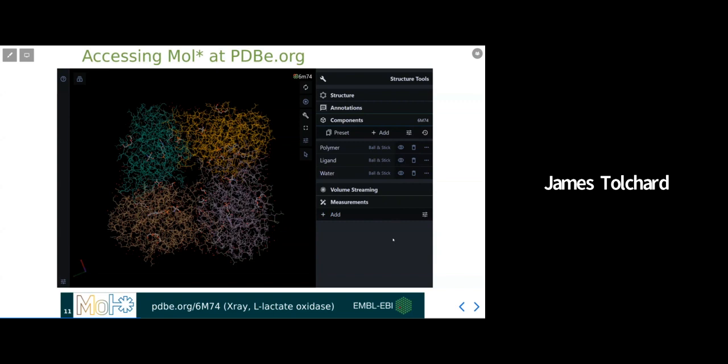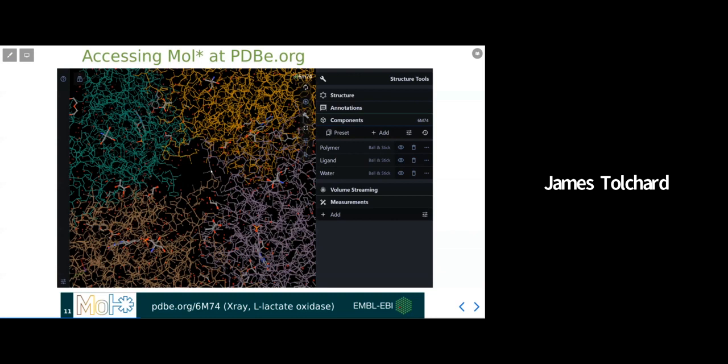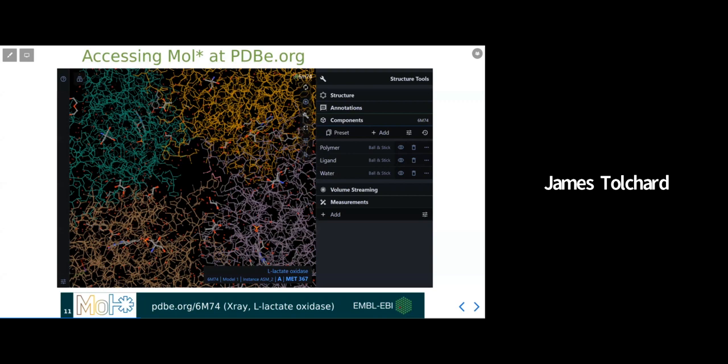And lastly for this section, you might have already spotted something. If you hover over a particular region of the structure, you'll get information about that selection shown in the tooltip along the bottom right of the viewer. By default, you can see we're able to quickly get the molecule name, chain and residue type and number for our selection. And you will see in other sections of the talk how this information changes depending on the granularity of our selection and whether we're projecting any other annotations onto the structure.